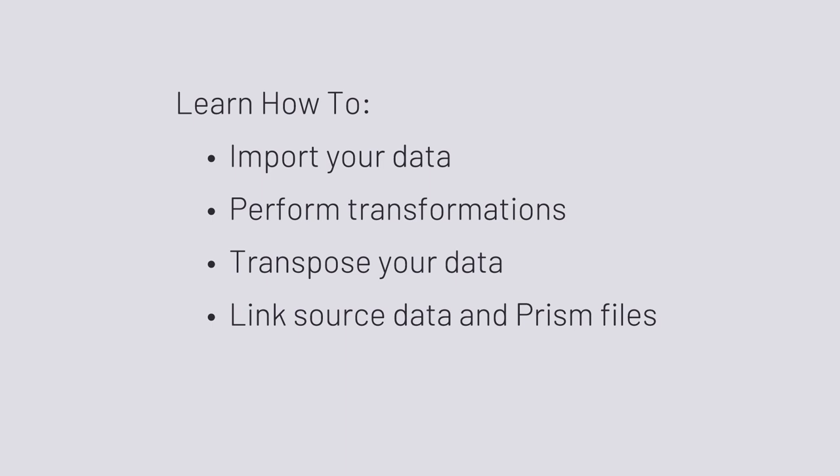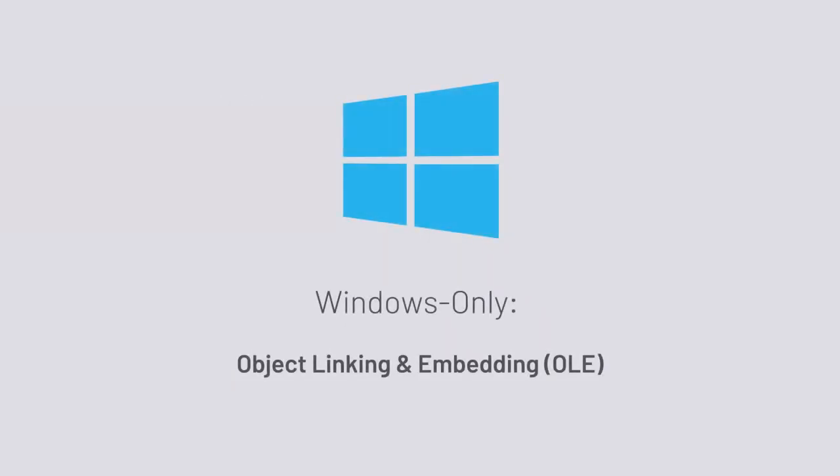Before we go any further, I do have to point out that the features I'll discuss today will provide some of the few examples in which features in Prism for Windows and Prism for Mac differ. These differences arise as a result of a technology developed for Windows called Object Linking and Embedding, or OLE, for which no equivalent has been developed for Mac. So as we go through some of these features, I'll be sure to point out if they're specific for one operating system or the other.